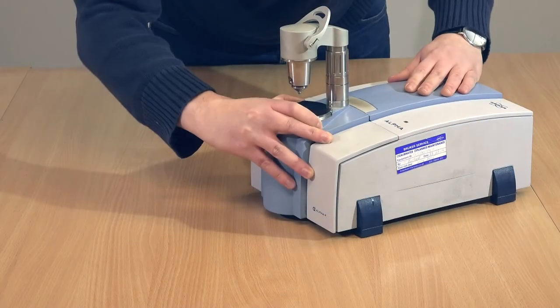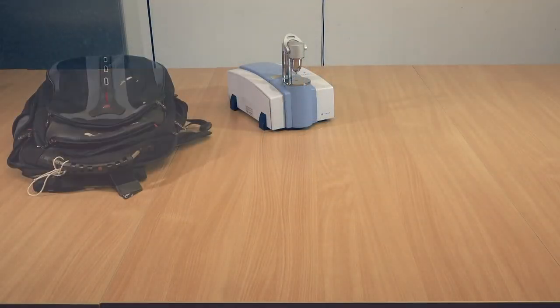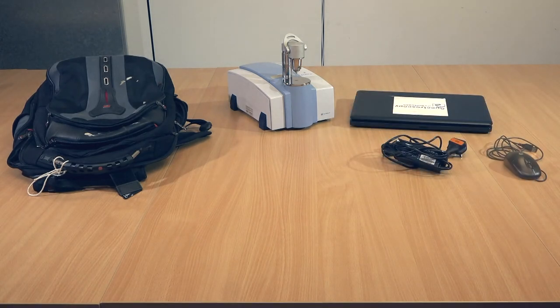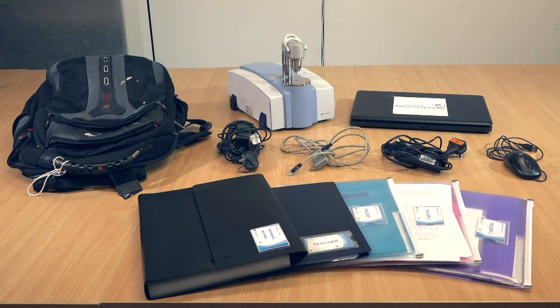Everything else is in the rucksack. It should contain a laptop with power supply and mouse, a power supply for the spectrometer, an ethernet cable and adapter for connecting the spectrometer to the laptop, and teaching materials for the workshop.